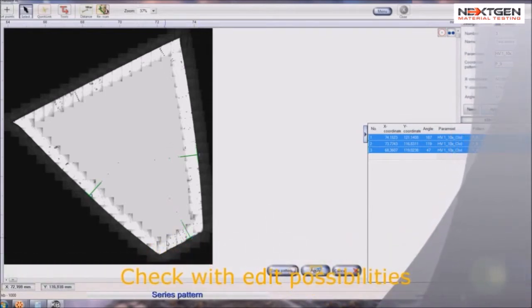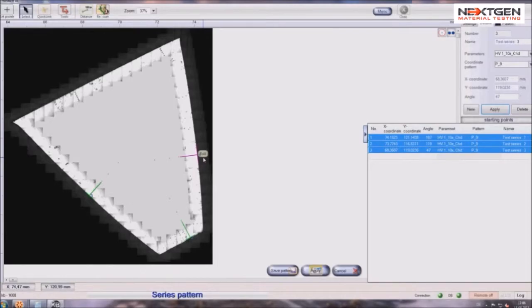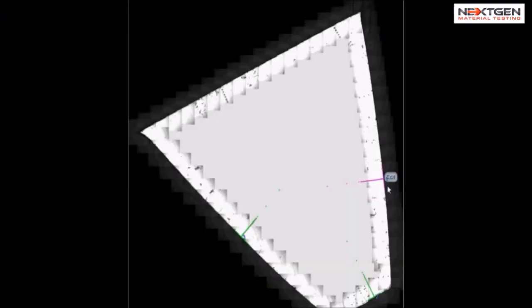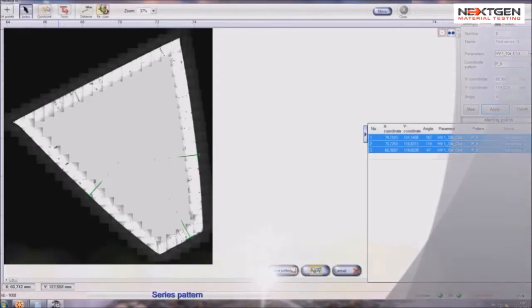The newly created row can be controlled with the editing function. Move the mouse cursor on a row in the scan image until it appears in a different color. If a row is selected, an Edit button will appear next to the starting point. By selecting this button, you enter a new Edit menu. Now you can create a quick link. The quick link facilitates the positioning of the test series on a new sample with the same or similar form.